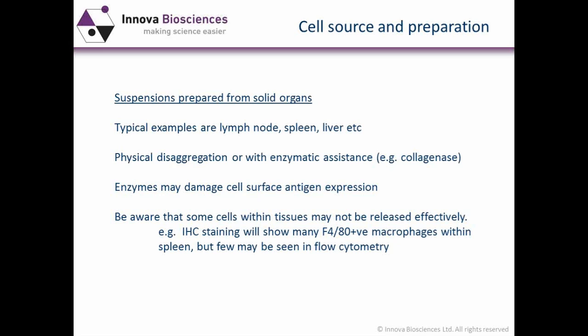Be aware that if you are using an enzyme such as collagenase, there is the risk that the enzyme may damage cell surface molecules, and therefore it may be good to culture those cells for a few hours after disaggregation so that those markers may be re-expressed.